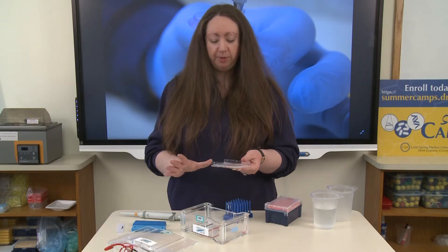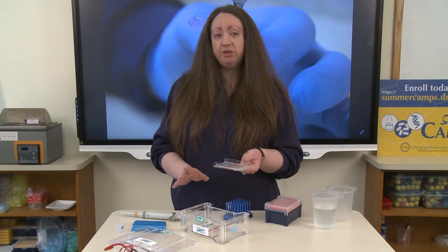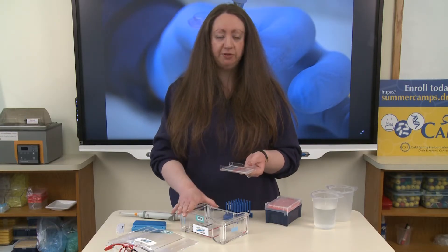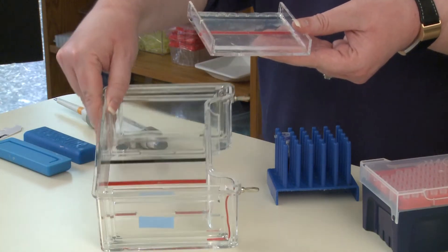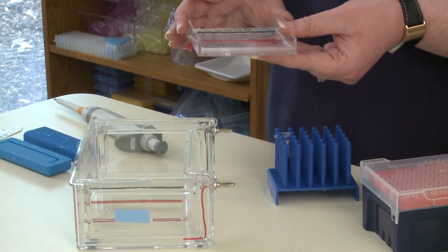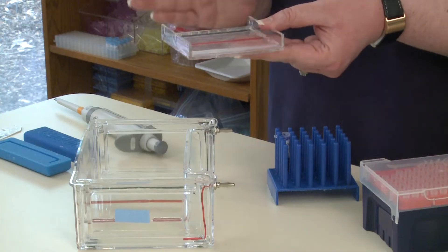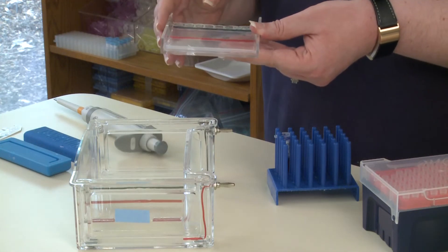Our gel is ready to be put into our gel box here. It's very important when you put your casting tray inside of your gel box that you line up the black line with the black line in your box, and the red line with the red line in your box. This will ensure that the charges are in the correct place for when you're running your gel. If you do this backwards, your DNA will run behind your wells and into the buffer as opposed to through your gel.